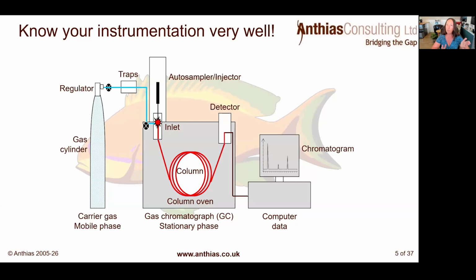Then once we've got all of those analyte molecules on our column in that nice narrow sample band, meaning they're all close together to get sharp peaks, then we've got to optimize our separation through that column. So optimizing our oven temperature program. And of course, then we've also chosen our GC column dimensions and type of stationary phase. Then we're going to elute them into the detector.